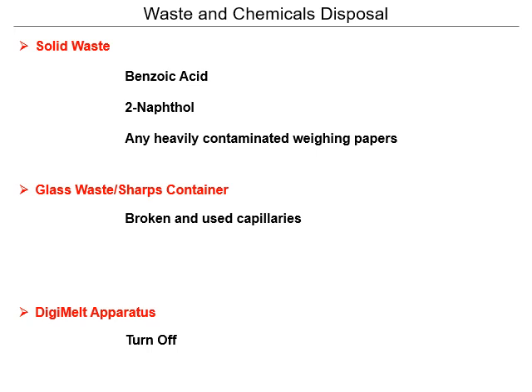For those 5 capillary tubes, we don't reuse those. They're just kind of like pipettes in that way. They're too easy to break, too hard to clean. So for all of those, you invert them and tap them again, try to get everything out of them that you can, but most likely you won't be able to get very much out. Those go in the glass waste container. It's the brown box labeled with broken glass, and make sure, like we said in our safety video, those don't go in solid waste. Those don't go in a normal trash can. They just go in the very specific broken glass container.